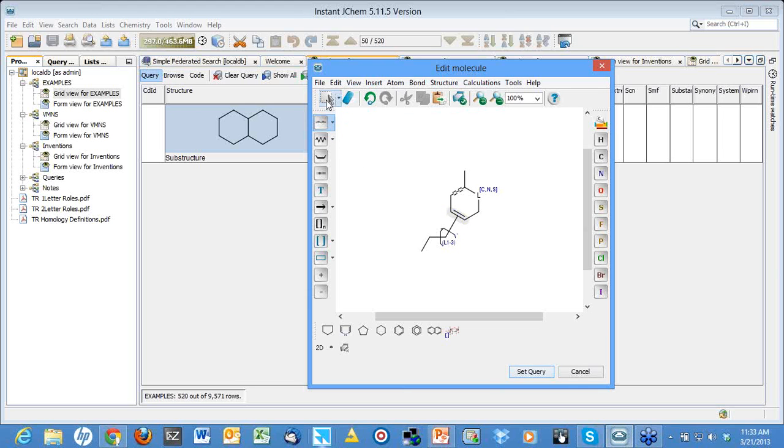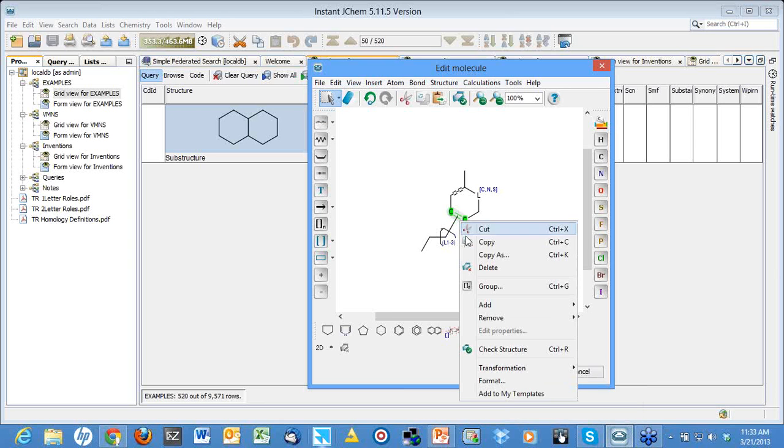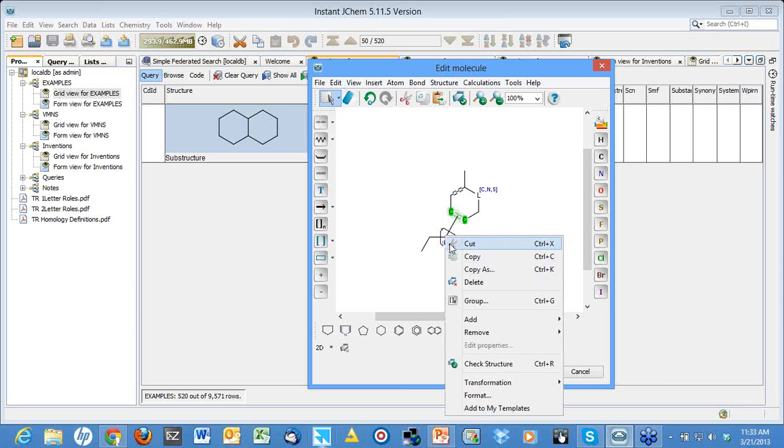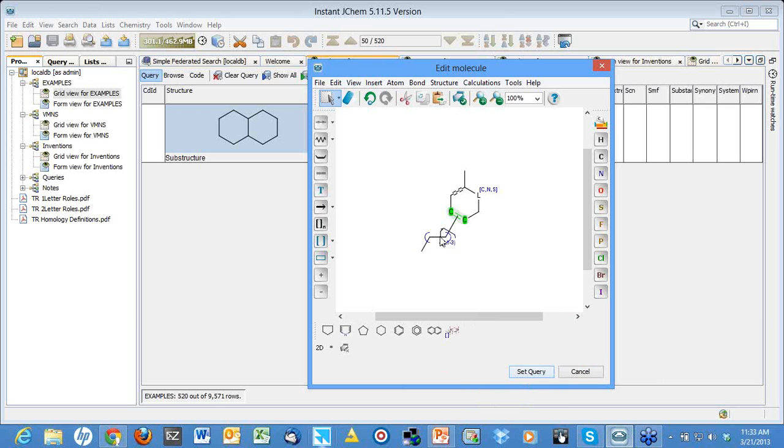And very easily you can do that by selecting the atoms you want to send the variation bond. You can right-click, and in the Add panel, you can select Position Variation Bond. And more than that, to make it even more complicated, I can add link nodes, as you can see here. Again, very easy to do that as well.